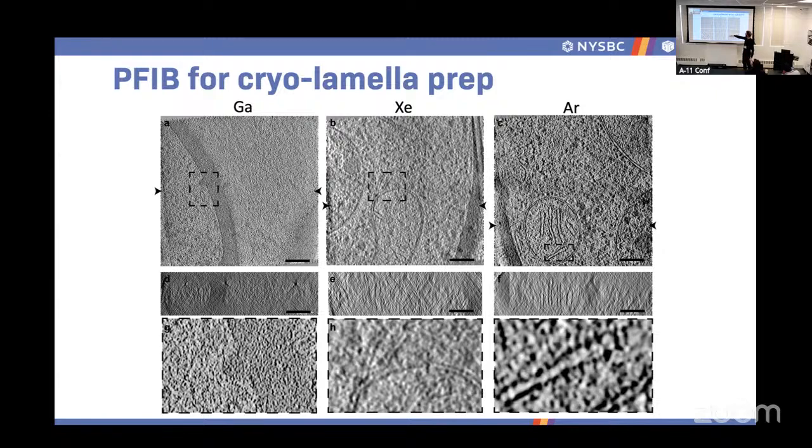But generally speaking, these are three very different ion beams, and they all generate perfectly usable tomograms. So you can use pretty much anything that's on the market. In all cases, they will operate okay. Plasma FIBs will be better for thicker samples, generally speaking. If all you're looking at is cells on a grid, it doesn't matter what you're using. This is a reality.